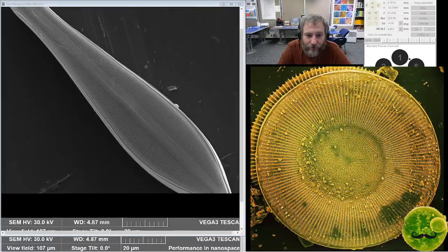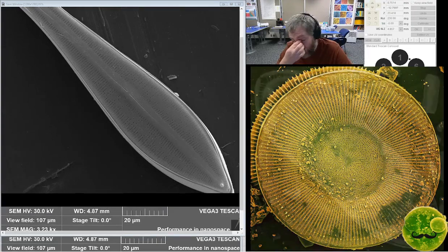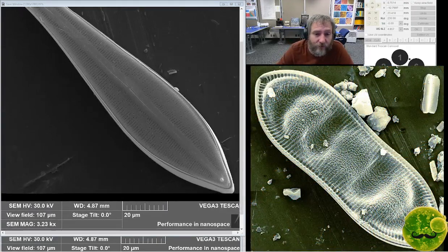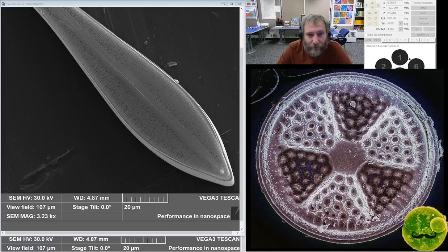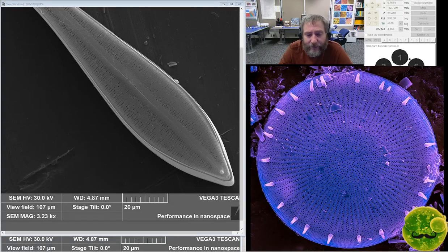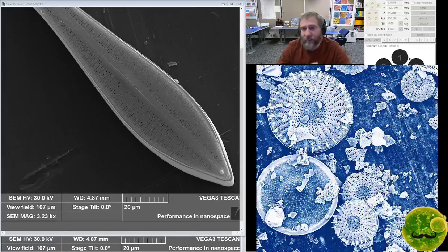And I'm doing actual research at the moment. So these are species, some of which we're working on describing, and some of which I'm just trying to define what we observe in the samples. These samples were collected from lakes Malawi and Tanganyika in East Africa. The samples were prepared, they've been in my lab for 5 years now. Were collected by my friend Itzi, and we're planning right now to go back to Africa this coming summer. And she's been doing all of the collecting for the last 5 years or so. I think maybe they might have skipped 1 year, but I'm not positive about that. And then she's looking at them genetically, and I'm looking at them morphologically. And she's got all the gene tools, and I have the scanning electron microscope.